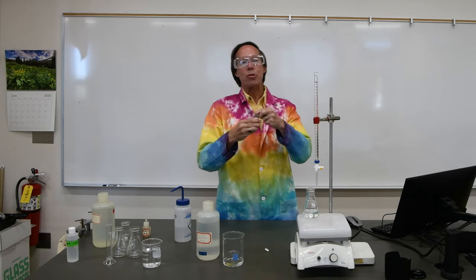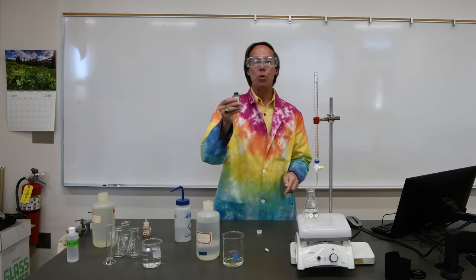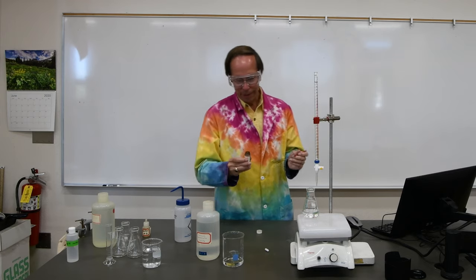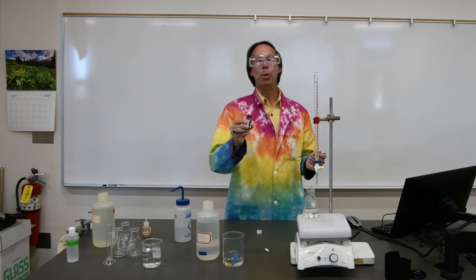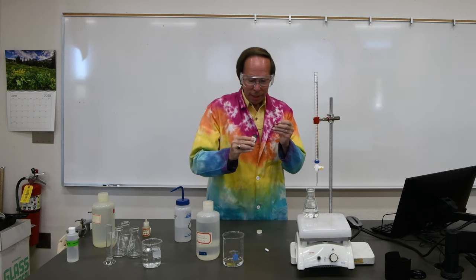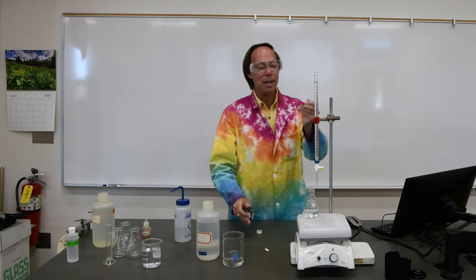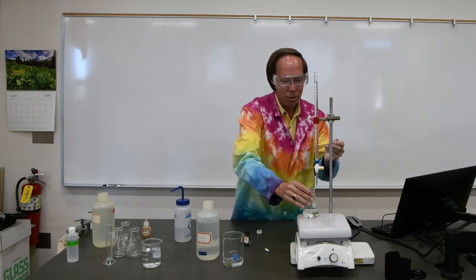Now, when students do this experiment, the number one problem they have is adding too much indicator. This indicator is extremely colorful. It takes a very tiny amount. In order to help people not put too much in, I've actually mixed this with salt. It's 90% salt and only 10% indicator. And even then, the amount of indicator we need is going to be a very tiny amount. I just put a few little specks onto the spatula.